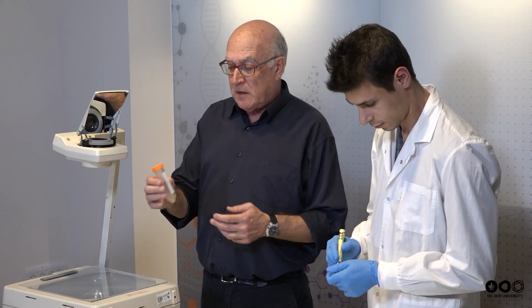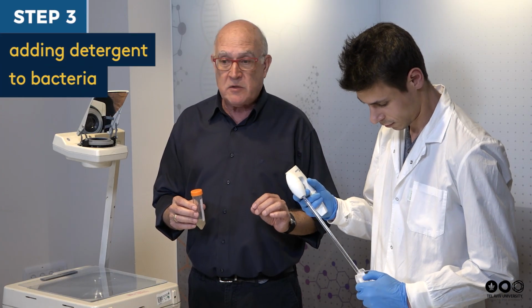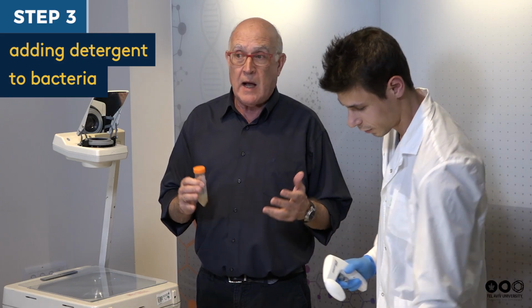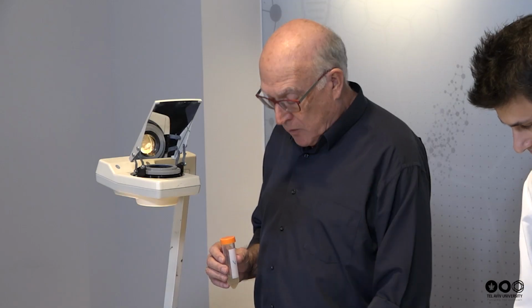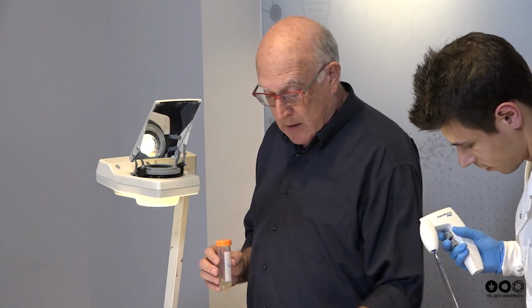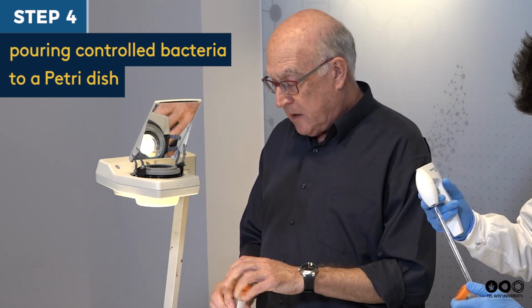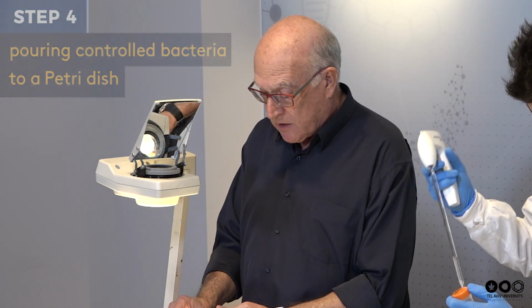And so now we take this tube. In the second tube, add the same amount, but detergent. And we'll be able to see how the detergent affects the bacteria. Once again, we're going to use the projector. And we're going to place some of the control bacteria into the Petri dish, as you can see here.